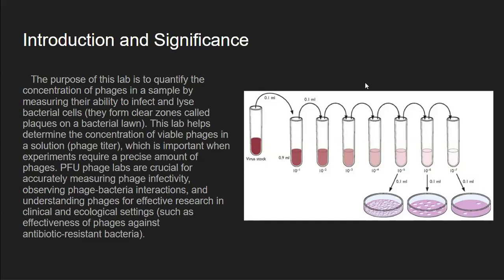PFU phage labs are crucial for accurately measuring phage infectivity, observing phage-bacteria interactions, and understanding phages for effective research in clinical and ecological settings, such as effectiveness of phages against antibiotic-resistant bacteria.